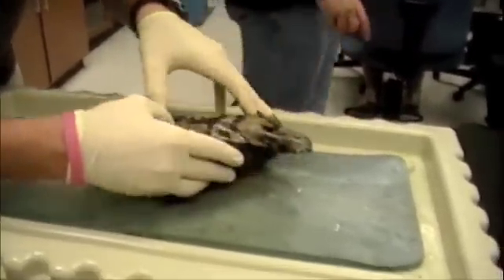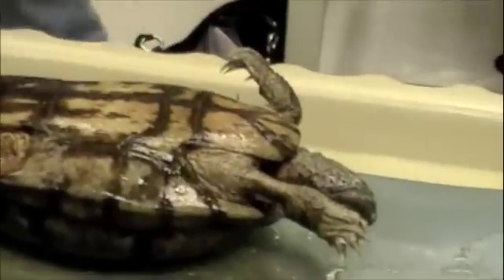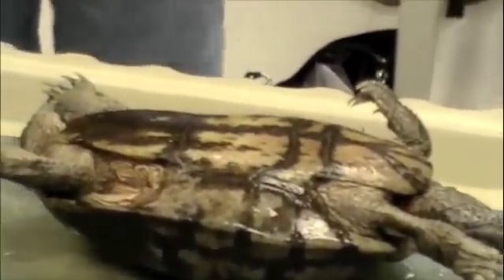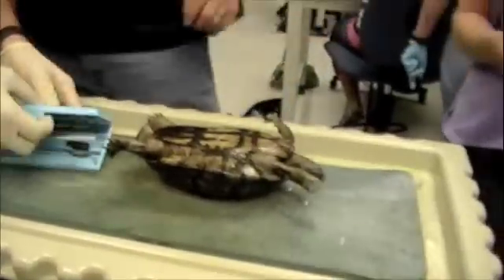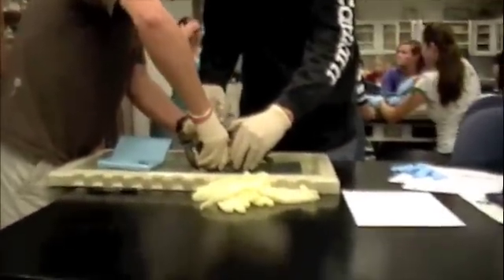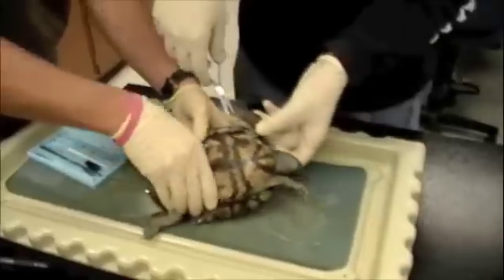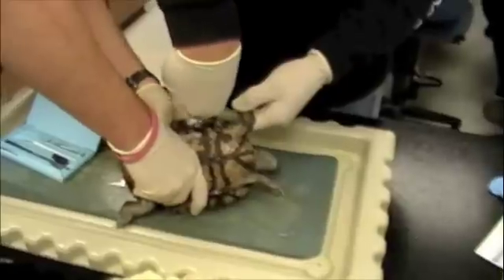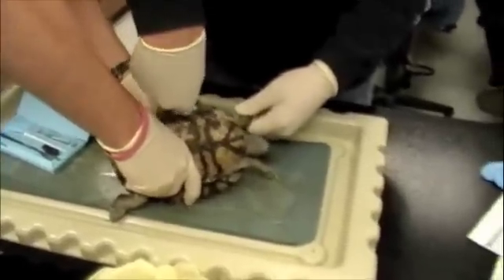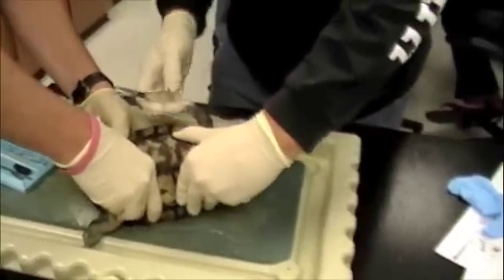This is horrible. These guys are struggling with this turtle. They made fun of a fellow student for asking a question about how to get the bottom shell off. Now look at them — cutting its arm off. Oh no. There you go — there's a lot of things like that. And that piece.